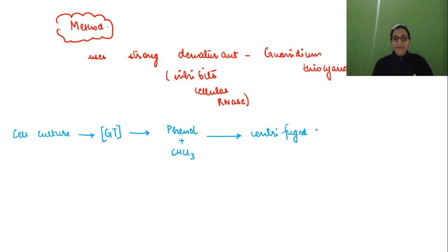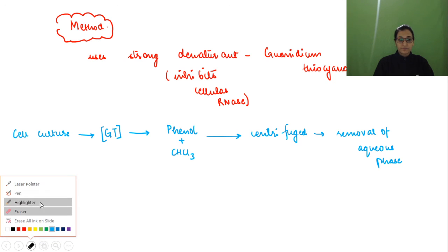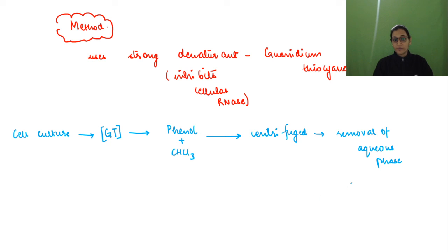Then we'll be getting the aqueous phase and the other phase. So removal of the aqueous phase will be done. Now the whole work will be done on the aqueous phase. So the aqueous phase will be obtained, and we'll continue from there.